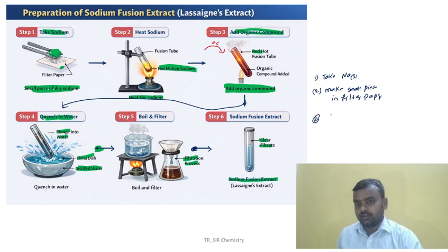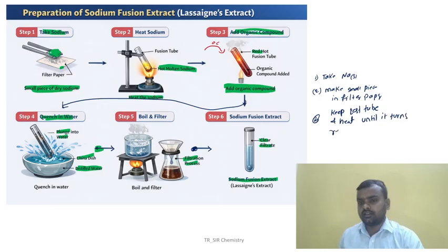And then the third point, keep it in the test tube and heat until it turns red hot.